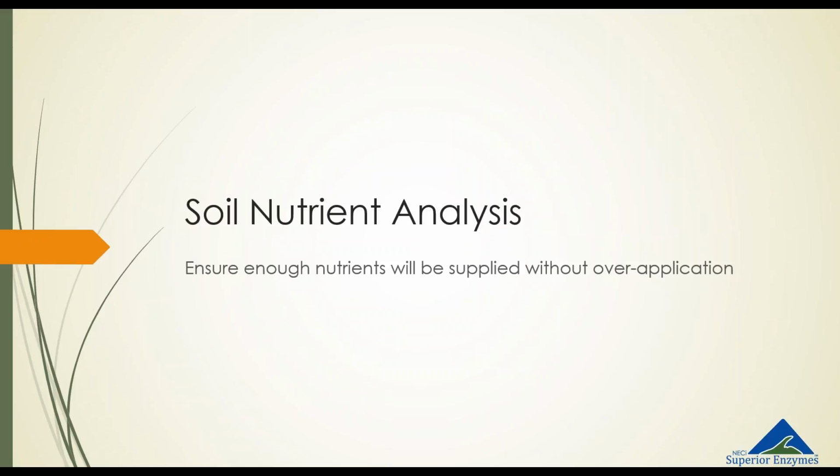Okay. What we started, the USDA has been funding our research and developing these tools because we started looking into this issue about who needed to measure nitrate, and we saw that the tools available for managing nutrients were really not adequate, especially for users that were on site and in the lab. So we've developed new tools for nutrient analysis based on enzymes.